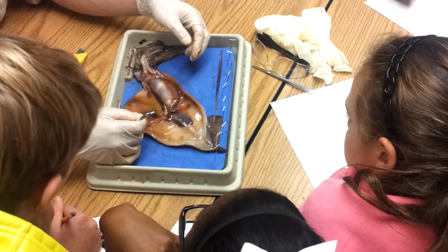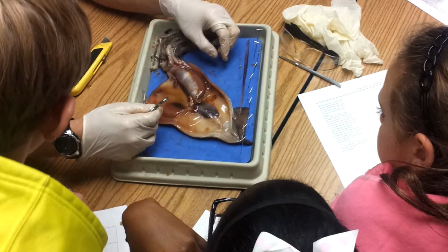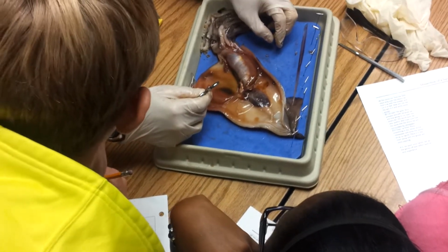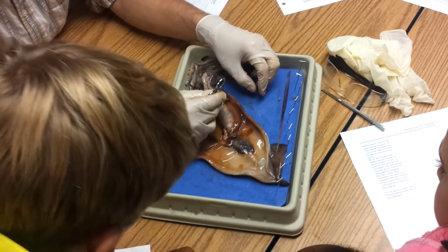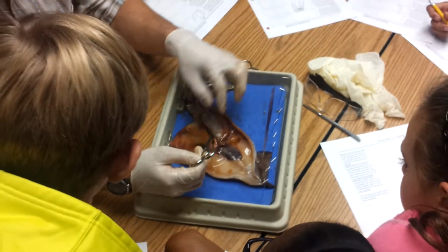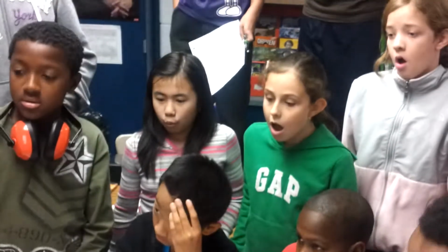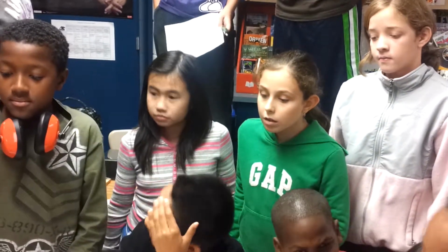Now, there is actually a heart. You can't see it. There's a little bump at the end here. There's a little tiny heart at the end of this gill, and at the other end of the other gill, which is pumping blood in and out to get the oxygen. And there's another heart in the middle. It's got 3 hearts. It's got 3 little tiny hearts. One at the end of the scale, one in the middle.